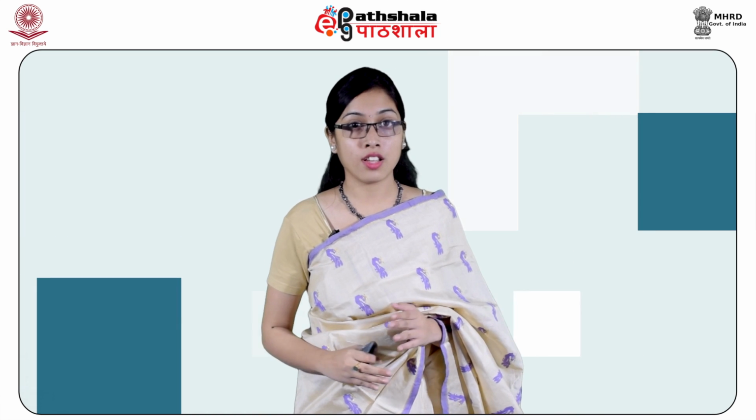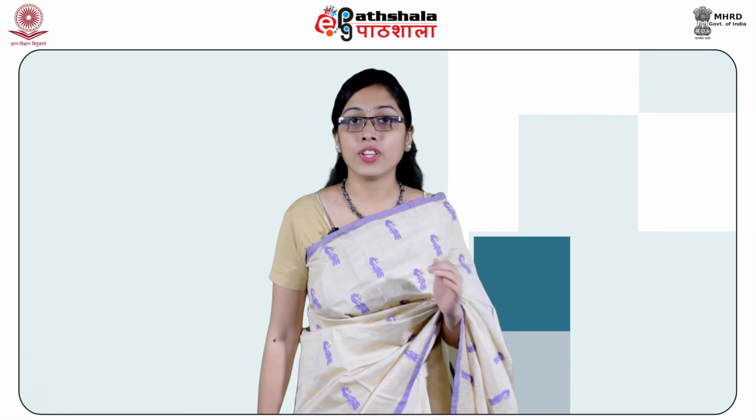If this factor is in the range of 20 to 30, elution time becomes too long. But if it is less than 1, then the solute passes out without interacting with the stationary phase. Ideal values lie between 1 to 5.